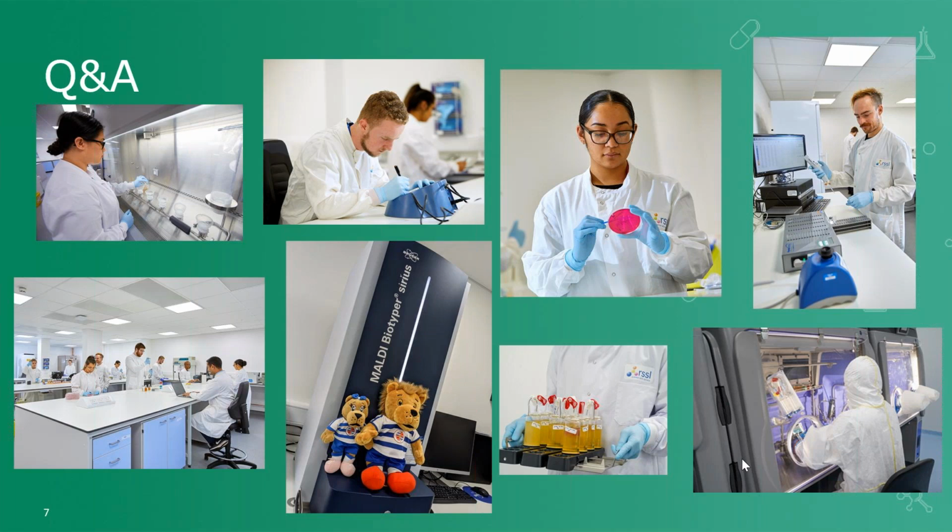So the first one I have was from Eugene, and he said, are there regulatory requirements for visible and subvisible particles in ATMPs? And if so, how do you deal with it?